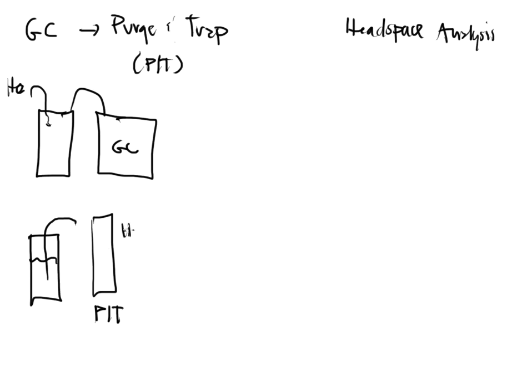And helium will be bubbled through that sample. And the purpose of the helium is to purge. We call this Purge and Trap. That's the purge part. So all of the purgeable organics will leave, and they will be, guess what? Trapped onto another piece in the instrument.